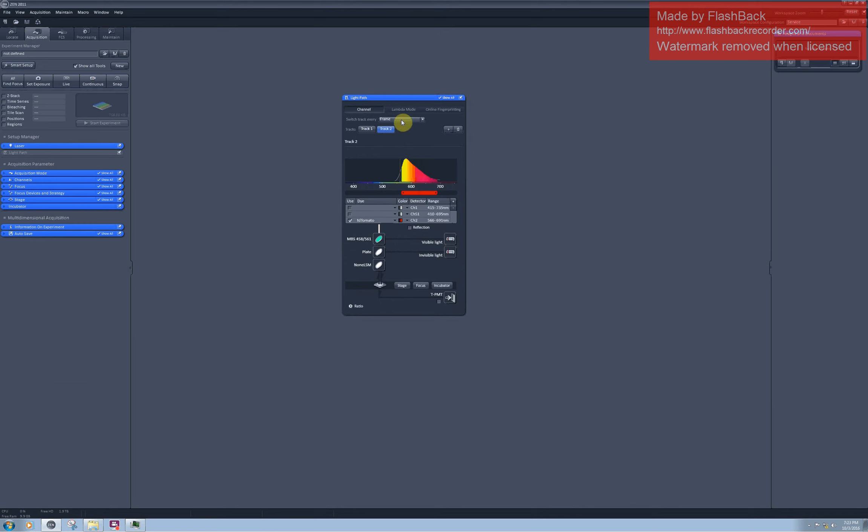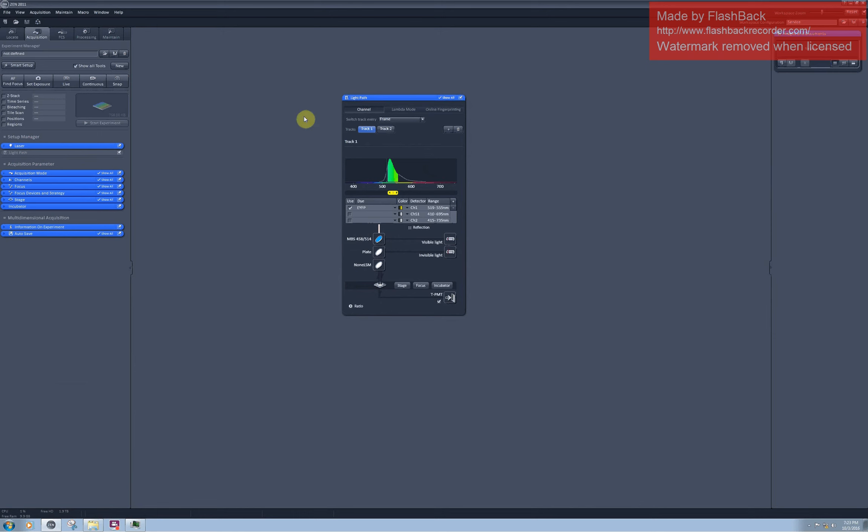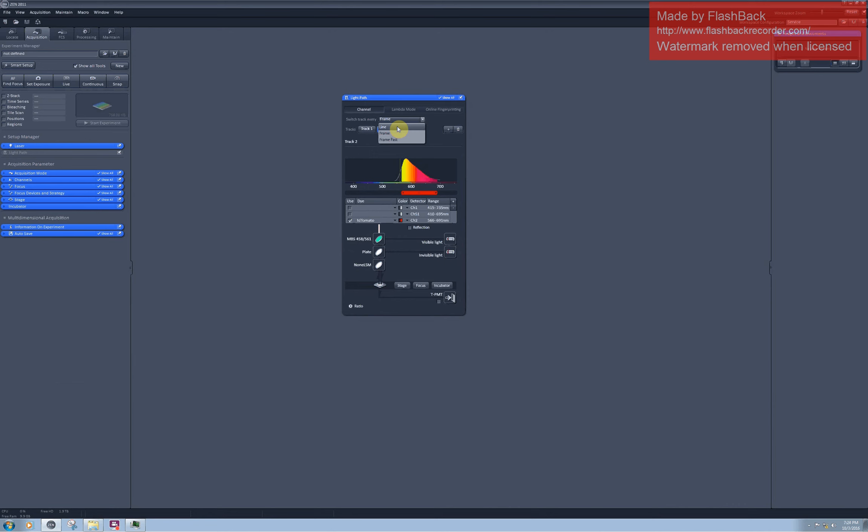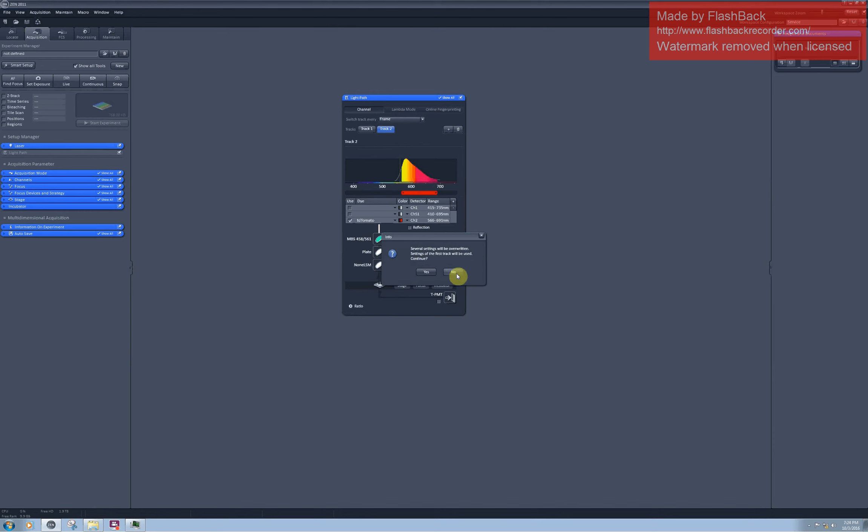As you can see, I can switch between each track every frame, every line, or frame fast. When I switch every frame, it means that the software will first scan the whole frame for detecting yellow fluorescence and only then switch to detect red fluorescence. If I choose every line, the switching will have to go much faster: one line yellow, one line red. In this case, not all the hardware will be able to move fast enough. For example, main beam splitter movement is quite slow. This is why you get this warning when you select every line switching. Settings of the first track will be used.